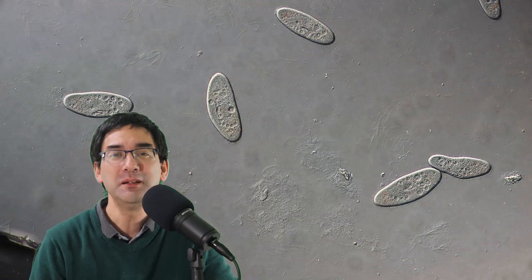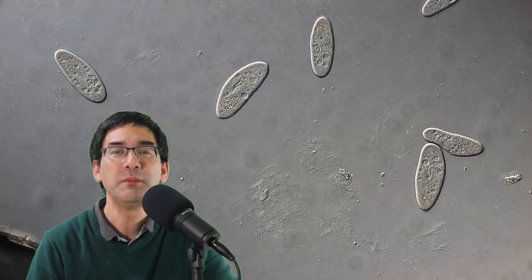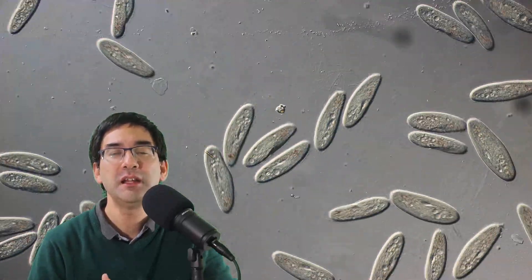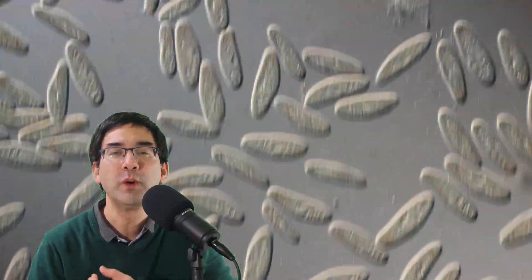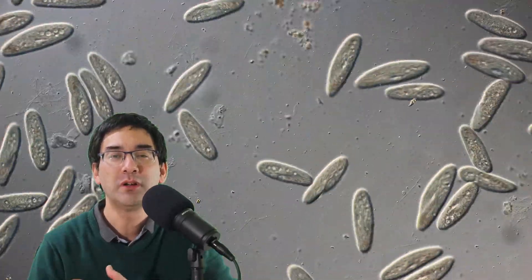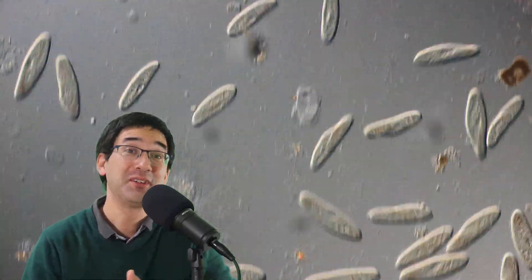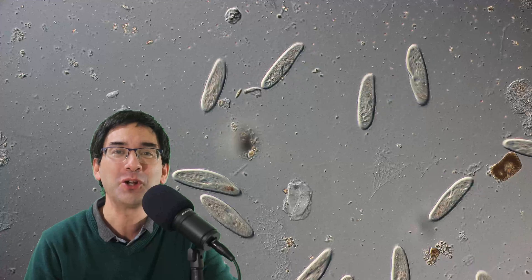So why paramecia? Paramecia are quite common and popular specimens to observe under the microscope. They're single-celled protists and they're good for observation because, even though they're single-celled, they're relatively large and therefore you can observe quite well what's happening inside the cell. They also like to move around and they respond to the environment, making them quite fun and interesting to watch.